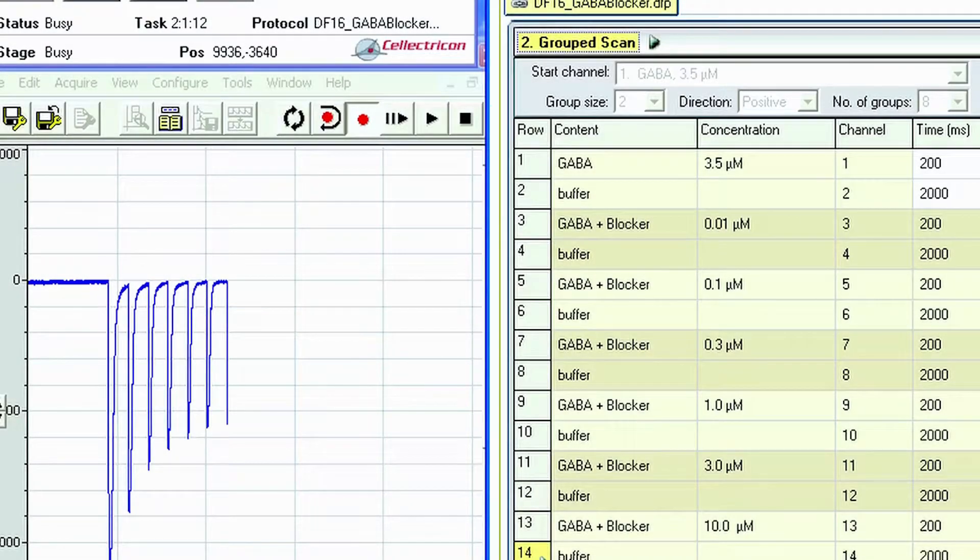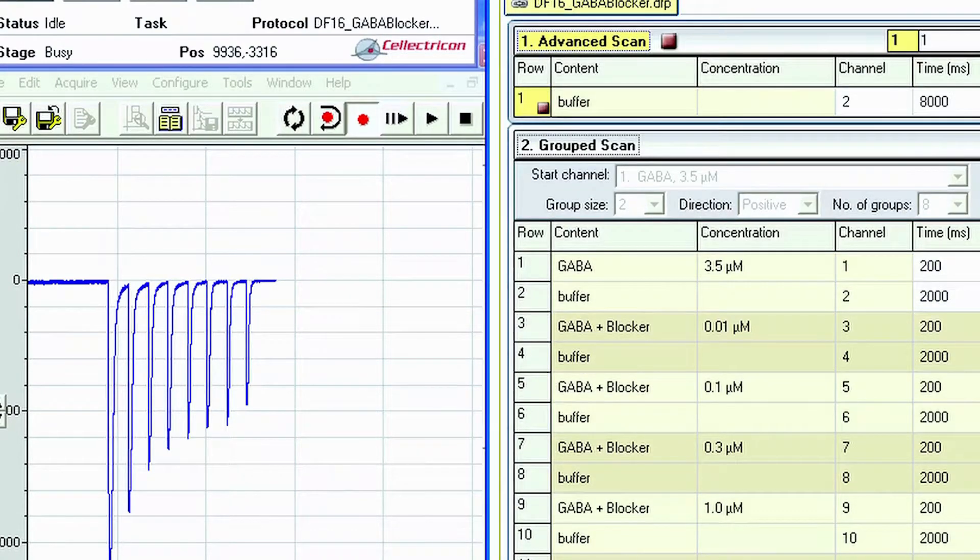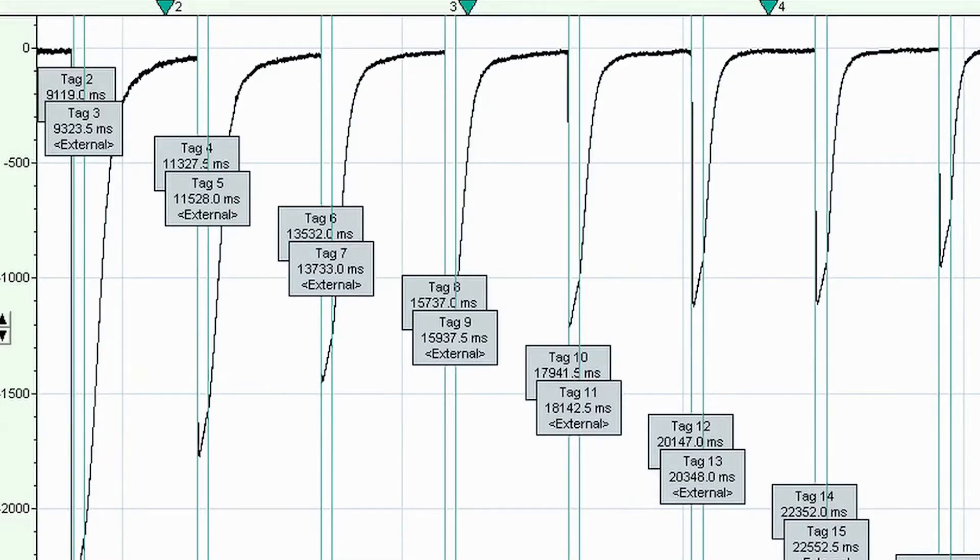The start of the recording is synchronized by a start trigger from the Dynaflow Commander software to the patch clamp software. Channel triggers can also be recorded to mark the exact timing of solution application together with the current responses.